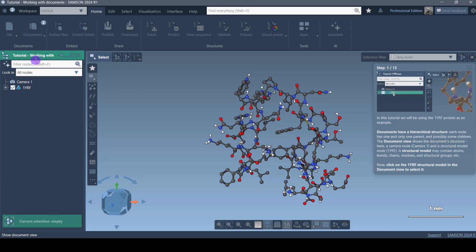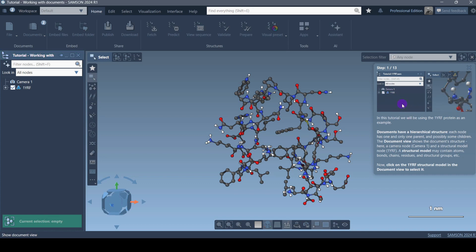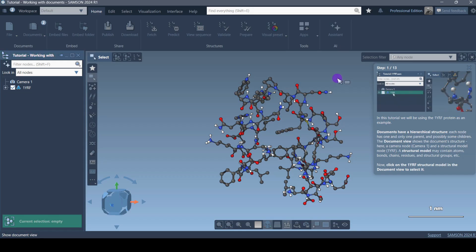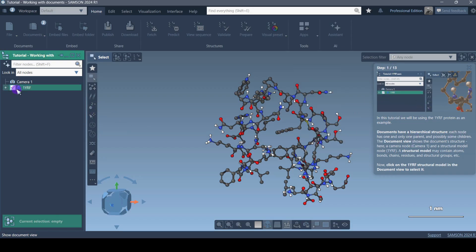When I click Start Tutorial, automatically a particular structure got imported, and there is something blinking on the left side with a mouse cursor moving, directing me to a particular tab. It's pretty easy and self-explanatory. I can see we have 13 steps to complete, and it's trying to tell me that I need to click on this structure right over here.